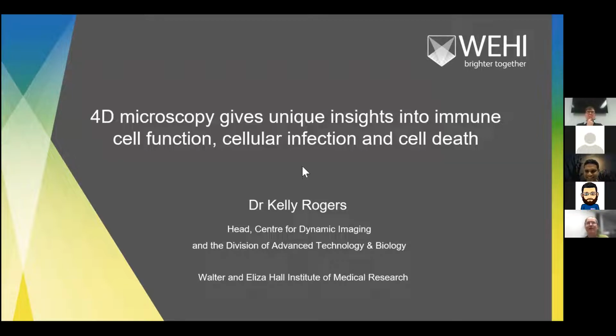So let me just click on that. So today I'm going to talk about 4D microscopy and how it enables us to obtain unique insights into immune cell function and cellular infection. As Katie mentioned, I'm going to talk a bit about malaria, which is the main focus of my lab. We collaborate closely with a number of labs, but especially with Alan Cowman's lab. And I'll also mention a project that we undertook together with Kate MacArthur and Ben Kyle, looking at apoptosis.